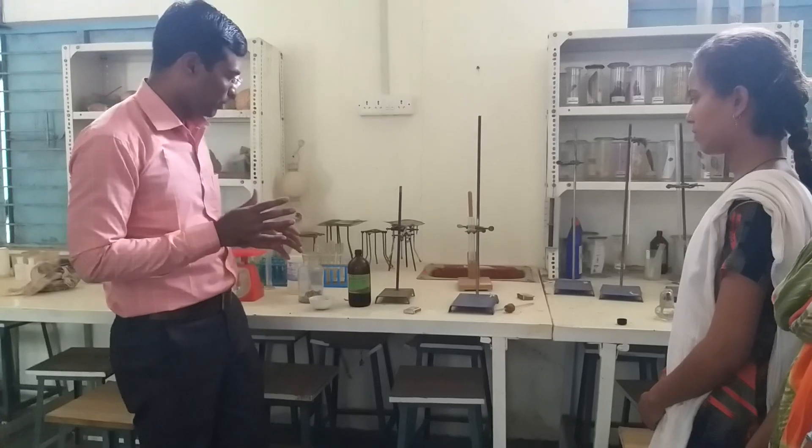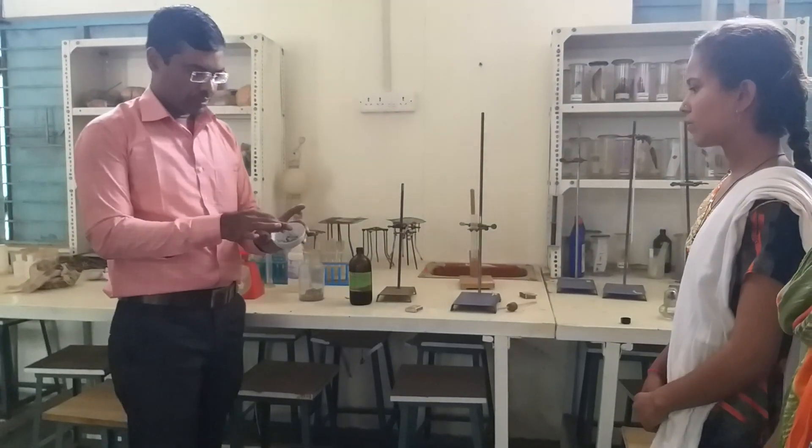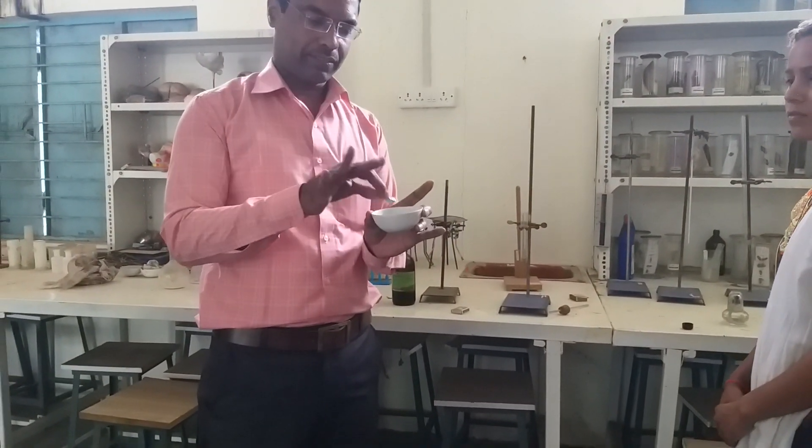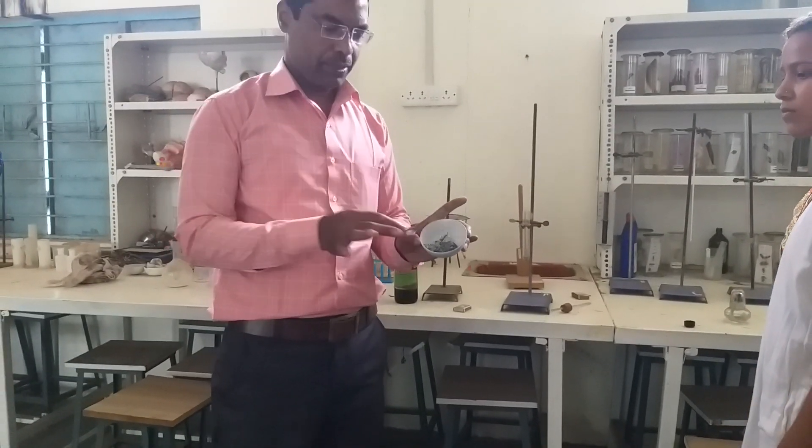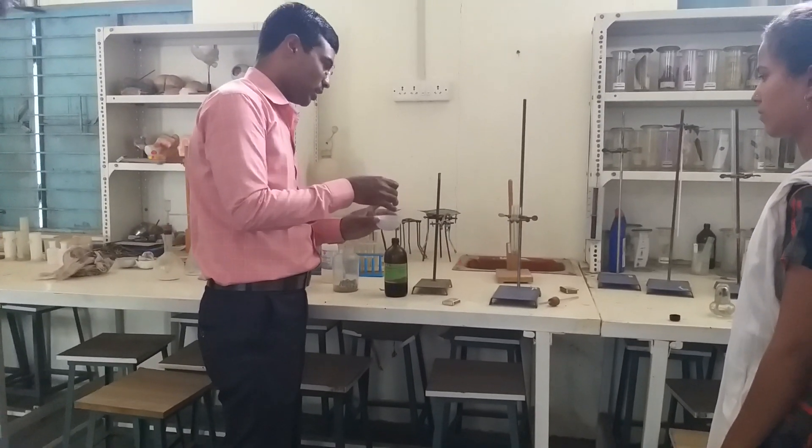Take the example of the reaction of zinc. So we have zinc. Look up, zinc is a silvery white metal. And we have to add some pieces of zinc in the test tube.